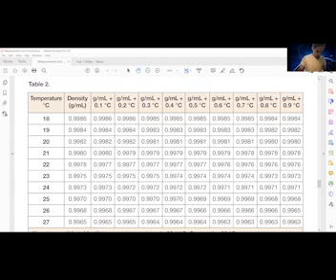And then hit the tare button, or T for tare. Does it say 0 now? It goes to minus and then goes to 0 and minus again. So it's varying a little bit because you're probably standing over it and breathing on it. It'll do that.